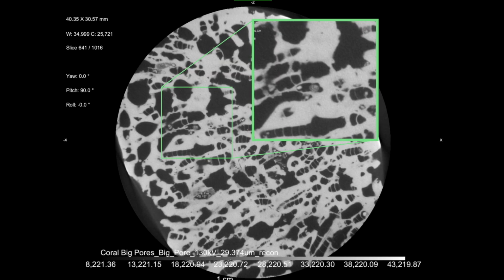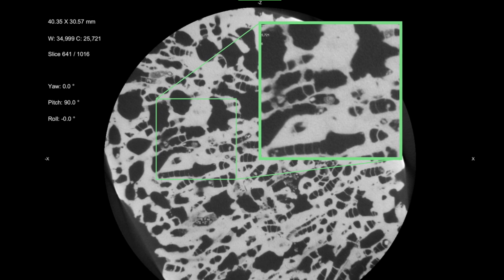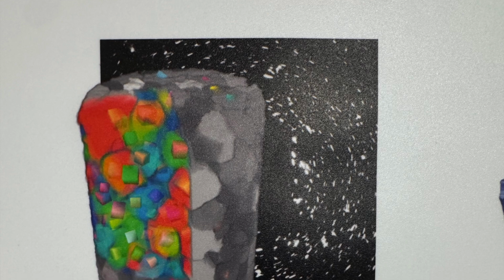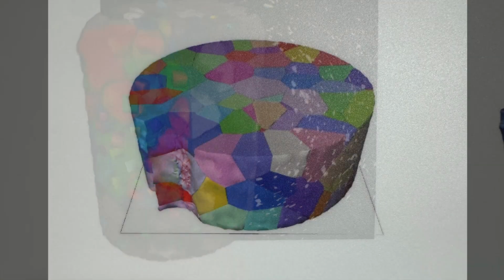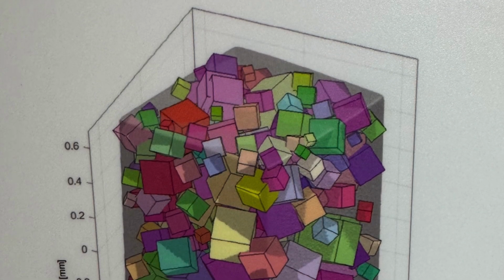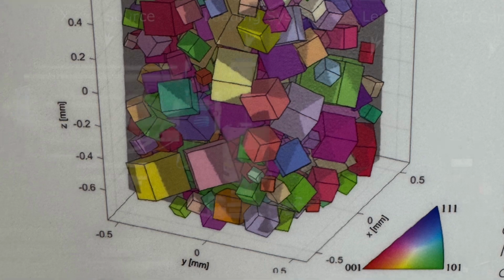The Zeiss can also utilize phase contrast tomography and dual energy tomography to enhance detail at phase boundaries and enhance compositional contrast. It can also operate in diffraction contrast tomography mode to deliver direct 3D crystallographic grain reconstructions for crystalline materials. This capability is critical for analyzing grain orientations and sizes, enabling advanced studies in material science.